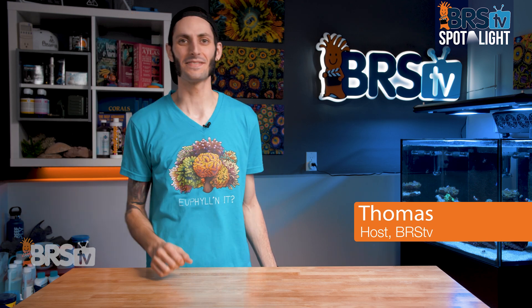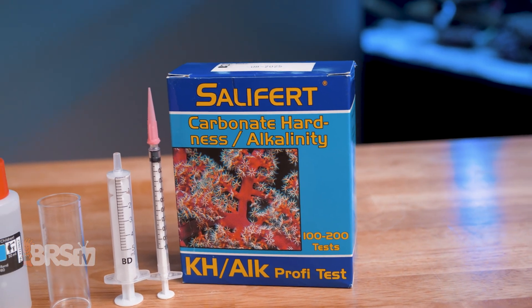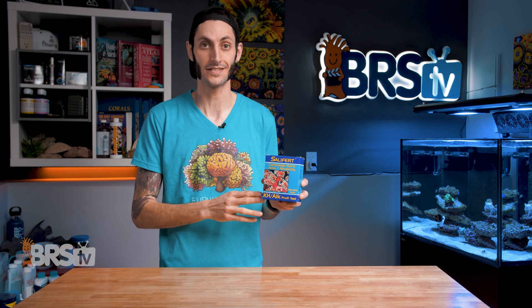Hey, it's Thomas here, and today we're gonna be taking a look at Salifert's Alkalinity Test Kit. We'll go over what you get in the box, what might make this a good test kit for you, and I'll show you how to perform this titration-based test.